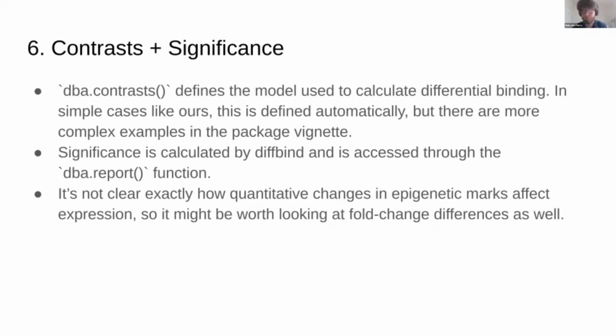Sorry, to me it was not really clear, your last point, that the maximum height or the minimum height of peaks doesn't matter. I guess it's not a straightforward interpretation in the same way that gene expression is. What I meant was that you might want to try filtering, say, all peaks with more than a 2-fold change or 3-fold change or something like that.